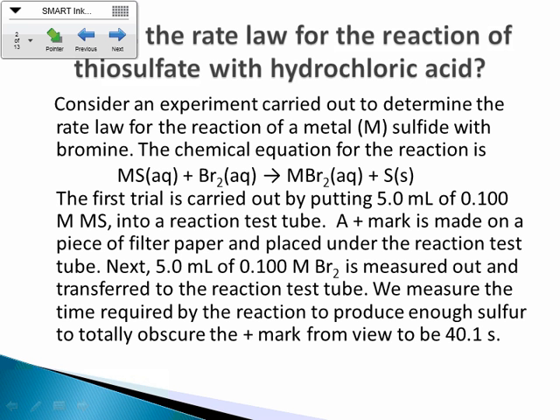Okay, so all of this intro stuff is basically just talking about the rate law. Where we really pick up here is where it says designing the experiment. That's the part where it gives you the lab data, and then it gives you some pre-lab questions about the lab data that should help you figure out exactly what you need to do when you're writing the procedure for this lab.